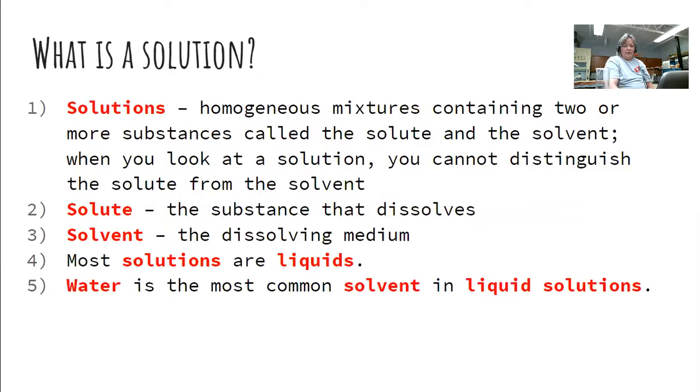Water is the most common solvent used in solutions, and hopefully from this demonstration, you'll see that you need to not assume that a clear liquid in your chemistry lab or even in your house is water, because a lot of times solutions look like clear liquids, but the solute inside that water could be dangerous to you, so you have to be careful.